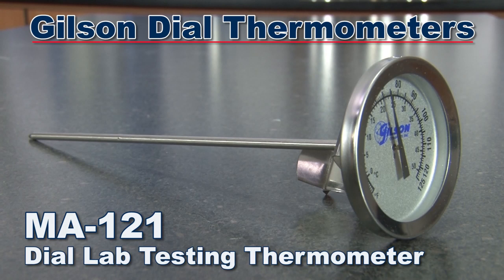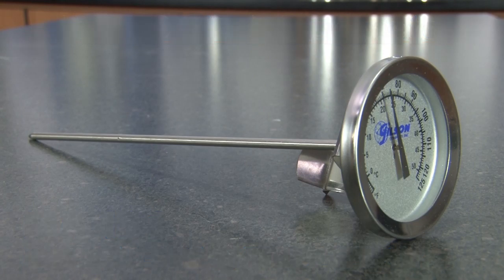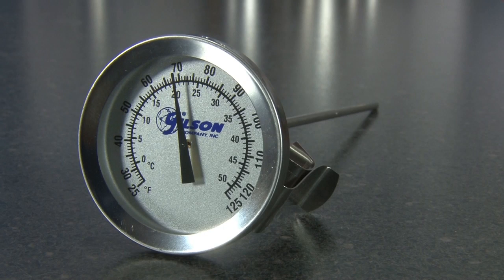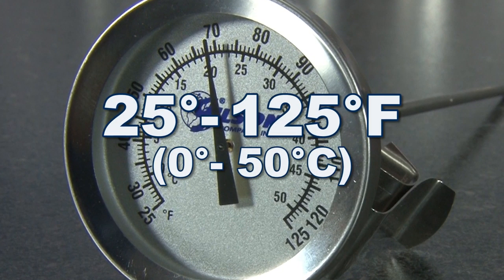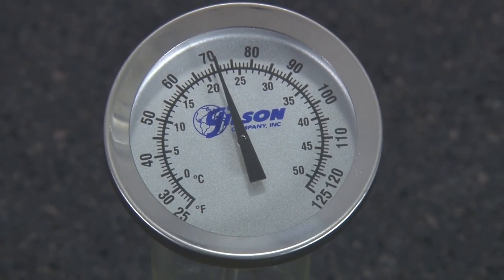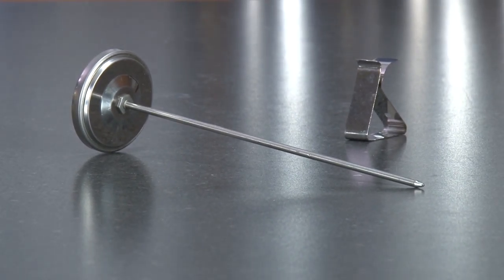The Gilson MA121 dial thermometer has the same temperature range as the MA124 but with measurements in both Fahrenheit and Celsius, from 25 to 125 degrees Fahrenheit with 1 degree divisions. The MA121 is also 8 inches in length and accurate to within 1%.